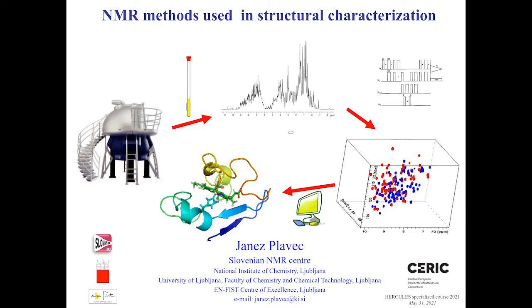So what I plan to do in this introduction section is guide you through this, not in detail of course, but what NMR is, what a spectrometer is. In fact, just touch upon making a sample, in the liquid state, and getting a simple 1D spectrum that actually tells us a lot but cannot give us full insight. Then a little bit we'll just mention, we'll not have time to elaborate, what we call pulse sequences that give us multidimensional spectra.